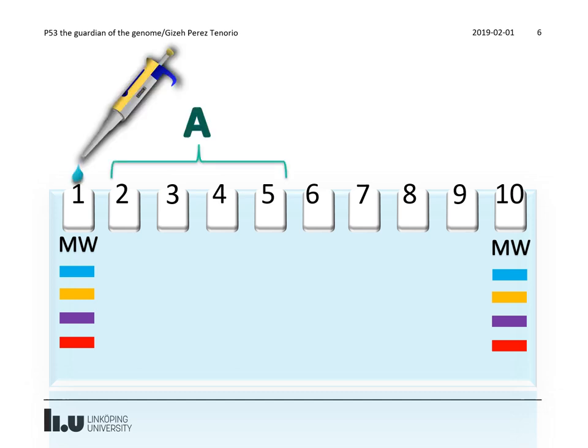It is important to keep your cell lines together. So in lanes 2 to 5 you can load cell line A, and in lanes 6 through 9 you can load cell line B.